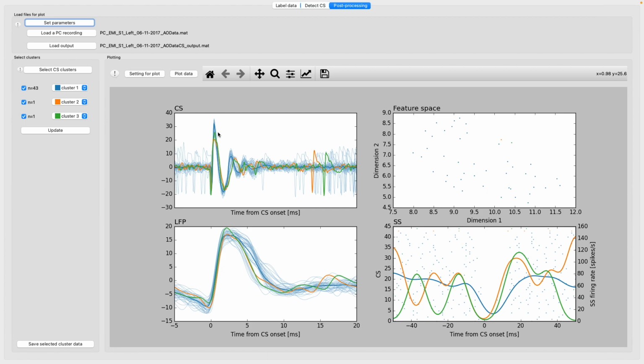It might be that over time they just became smaller, or perhaps they are really different. So this is where you can decide whether or not these complex spikes belong to the same cell. I think they do belong to the same cell in this case, with some minor differences. So I would just give them all the same color, blue.